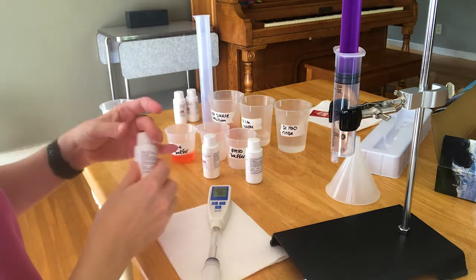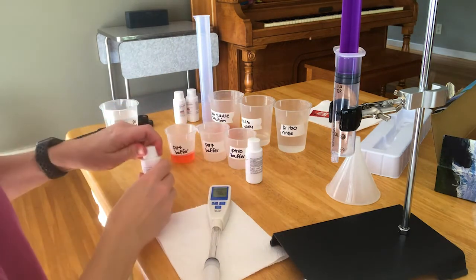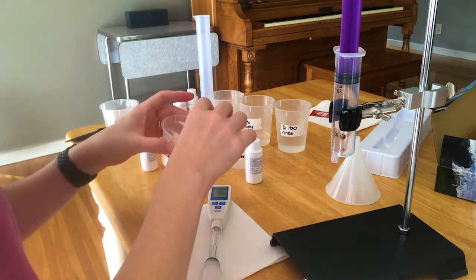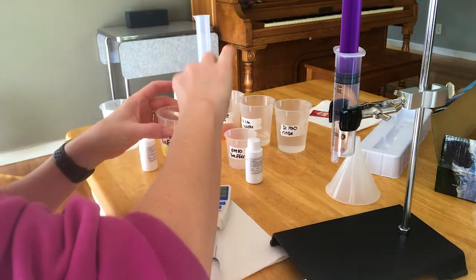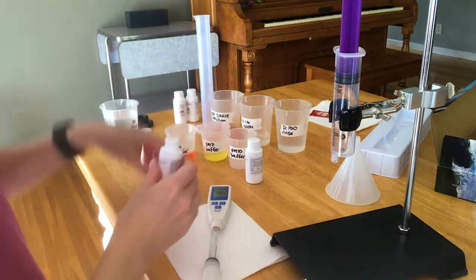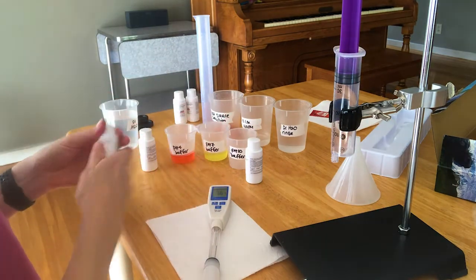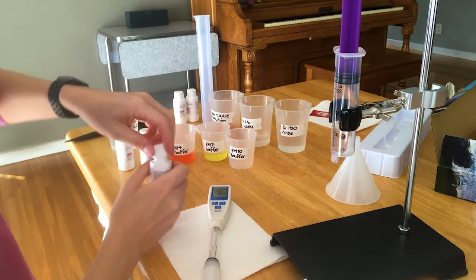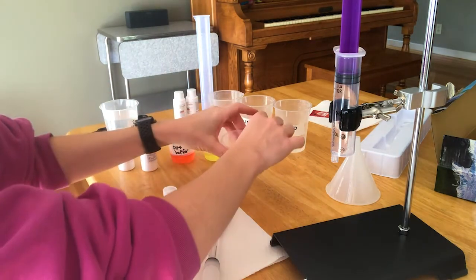It's really cool because they add coloring so that you can easily tell the difference between these buffers. Typically, the pH 4 buffer is this pink color. The pH 7 is yellow. I bet you can guess what the pH 10 is. Purple. Just kidding. It's blue.